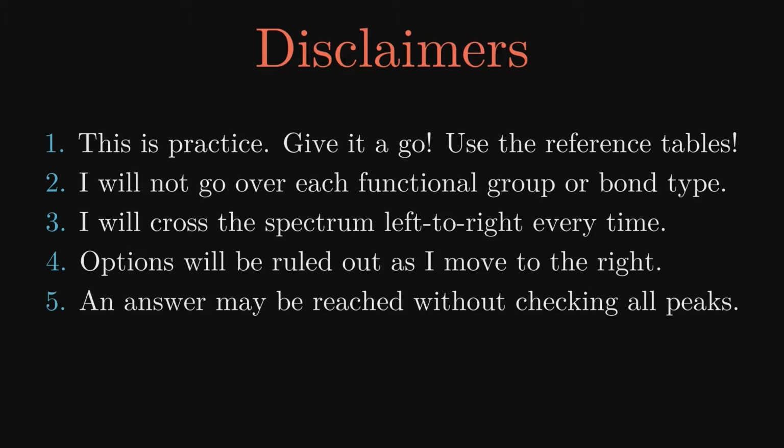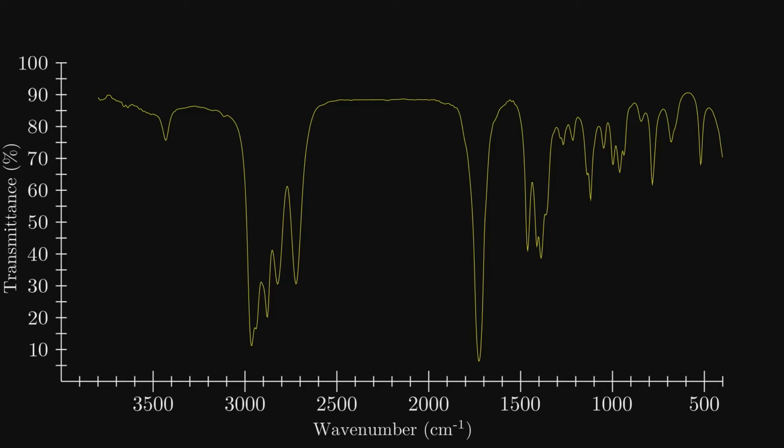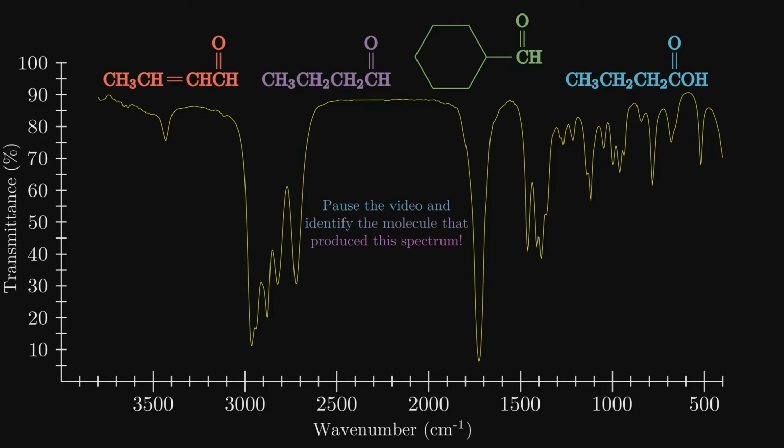Now let's get to the first question. So here's the spectra along with the candidates. Pause the video and determine which molecule produced it.